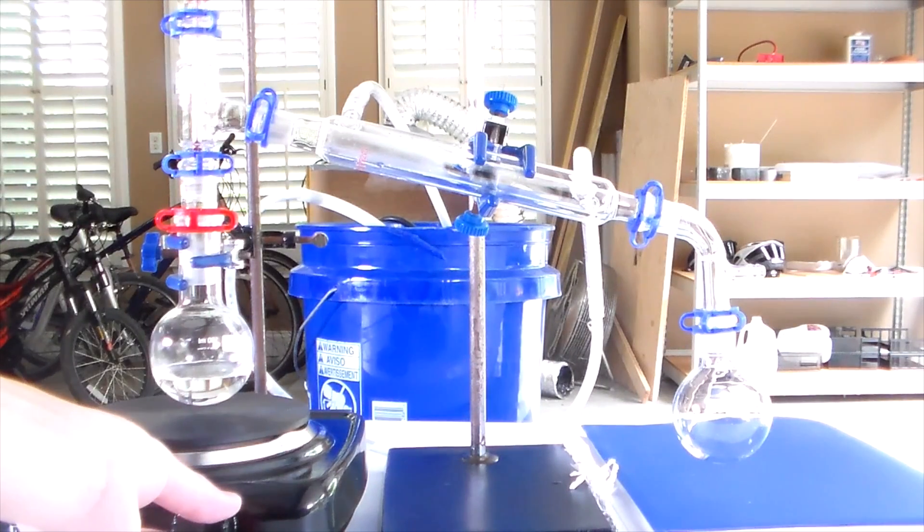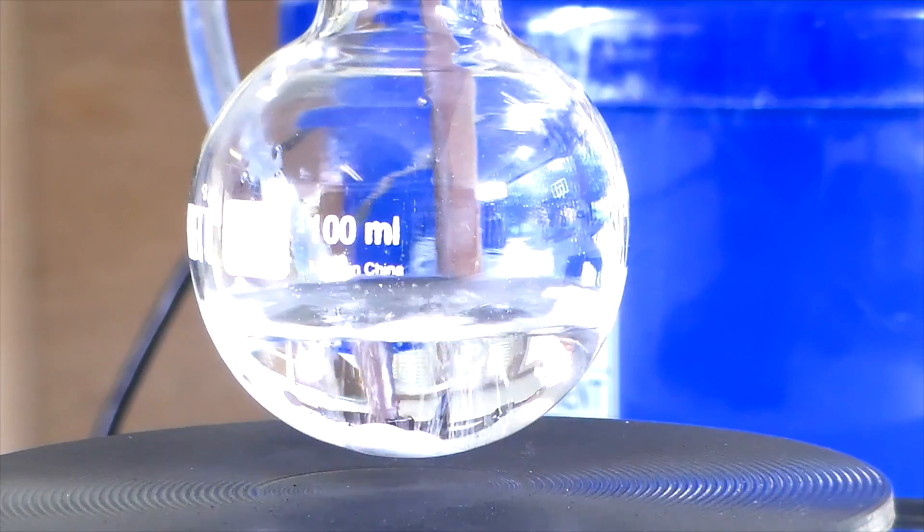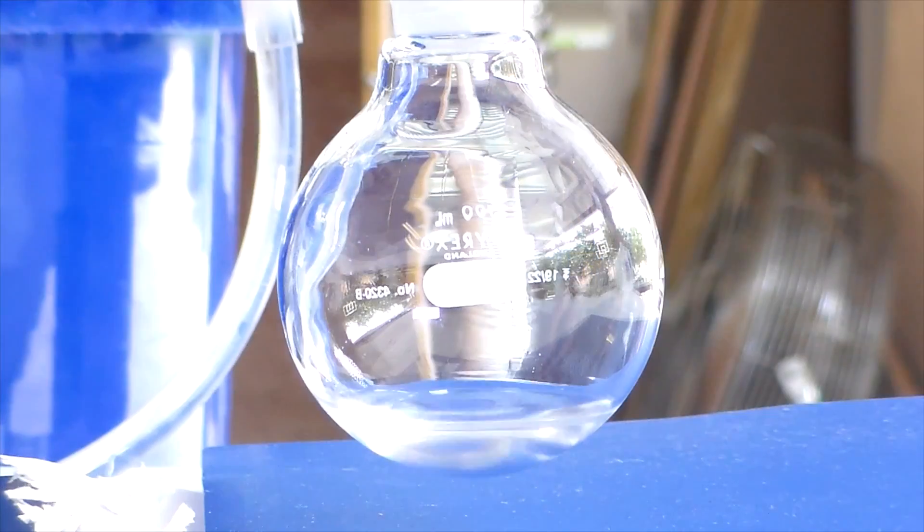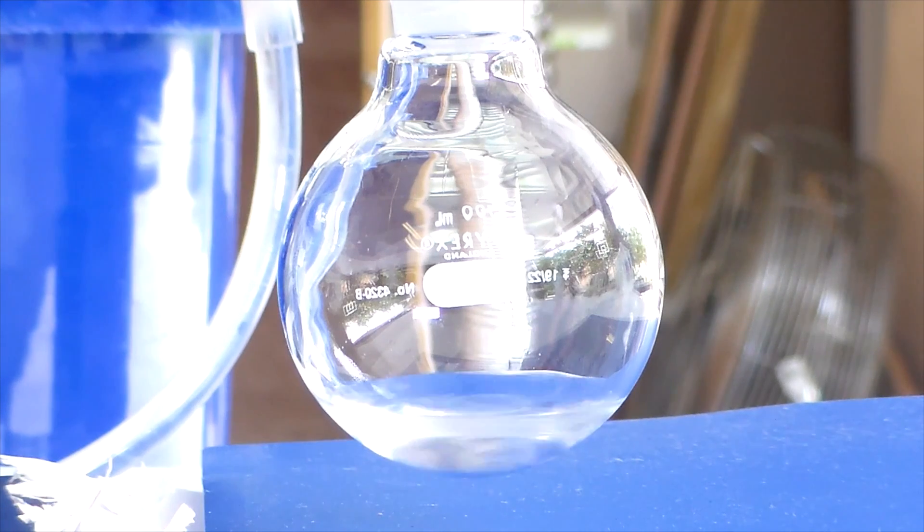Anyway, now set up a simple distillation apparatus and distill off the product. The tert-butyl chloride will be the first fraction to come over, boiling at 49 to 52 degrees Celsius.